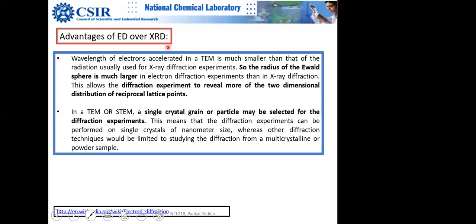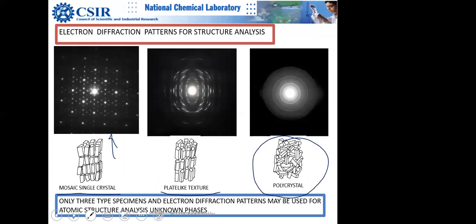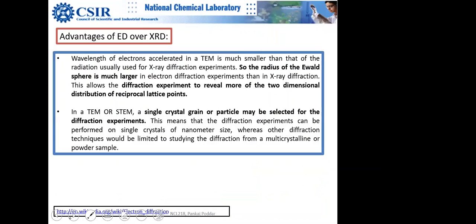I have another question. You told about the SAD pattern. Sir, that picture shows the rings. And sir, I am not getting how the SAD pattern comes. So okay, you are not getting how this SAD pattern comes, right? Okay. Let me explain to you.